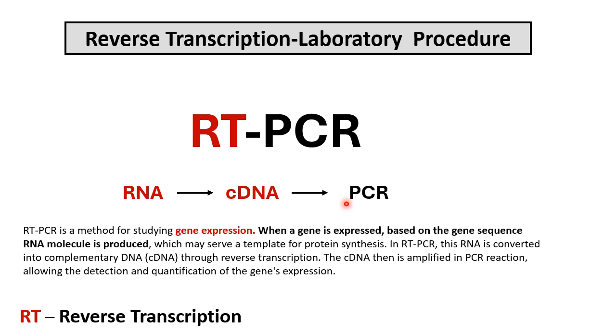And very important issue, RT-PCR is a method for studying gene expression because when a gene is expressed, based on the gene sequence, RNA molecule is produced. Later on, this RNA, if it is mRNA, can serve as a template for protein synthesis. And if the RNA is produced, in RT-PCR it can be easily converted into the complementary copy DNA and detected in PCR reaction.